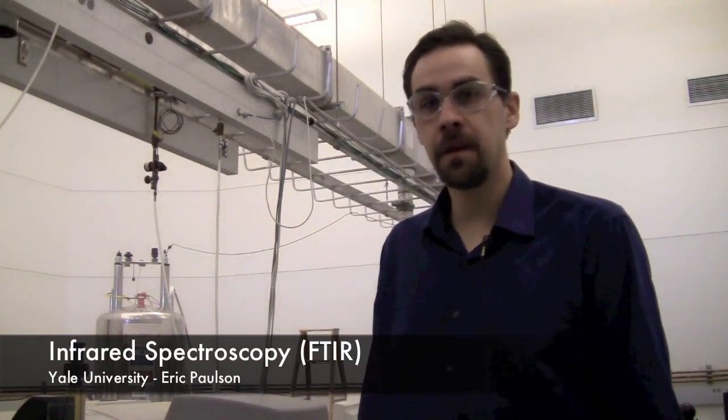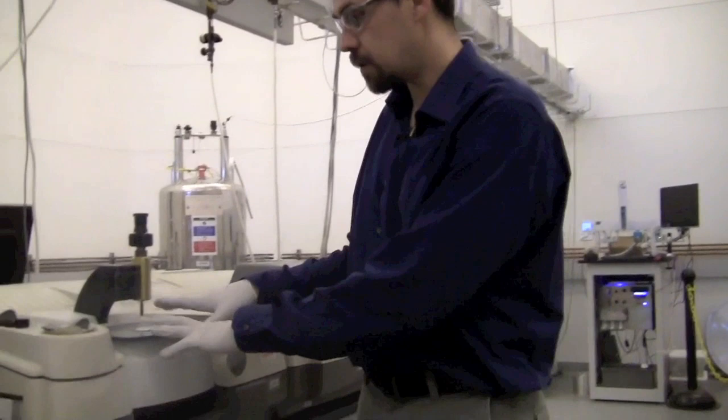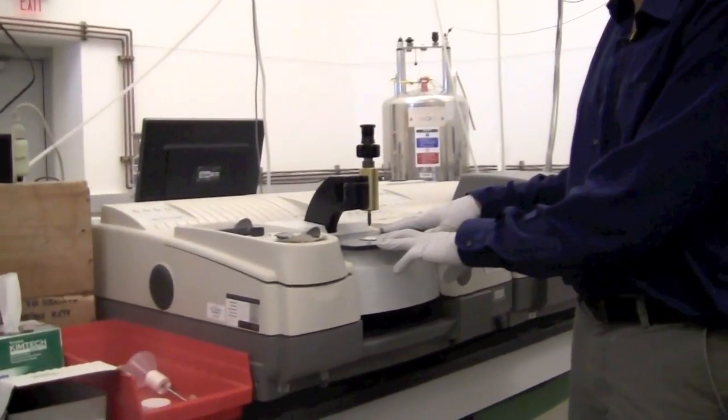This is an explanation of how to use the FTIR with the Smart Orbit Diamond ATR cell. Changing the Diamond ATR cell if it's not in there will be covered in another procedure. When you come to the instrument, it should already be set up with the Smart Orbit in place.